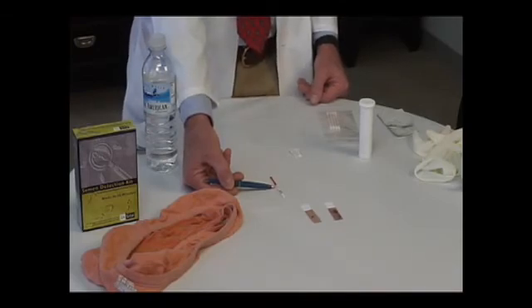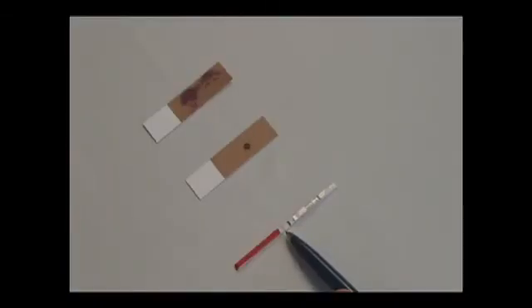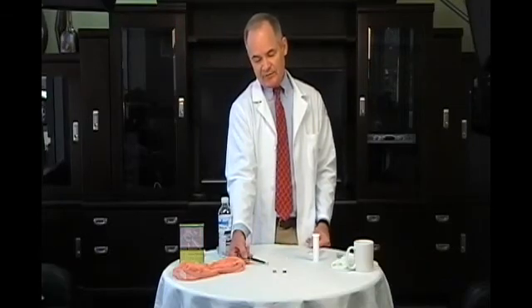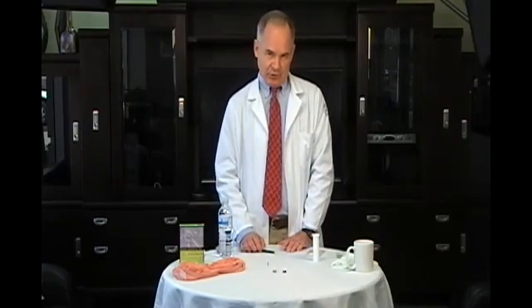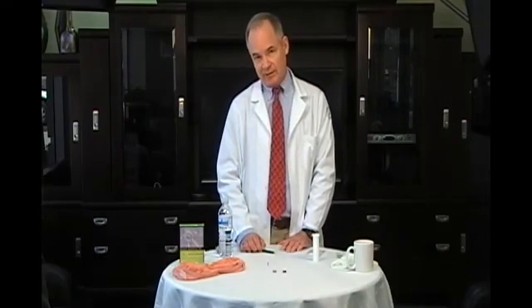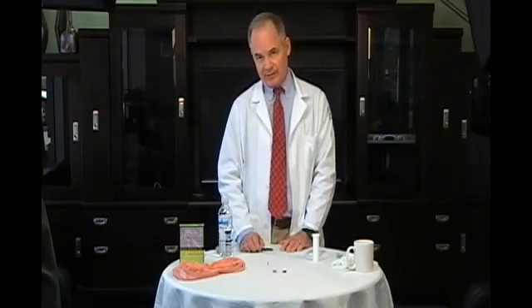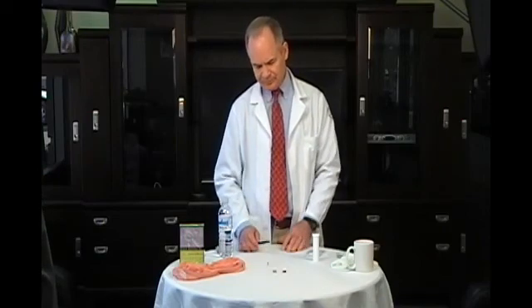The anti-PSA antibody, gold labeled, continues moving up the strip until it reaches the control region, where you have an anti-mouse antibody binding to it, and this also turns red. Now, this control region is calibrated for a PSA concentration of 4 nanograms per mil. At that concentration, the specificity of this test is 100%. In other words, the probability that this is PSA is 100%. So by inference, the probability is 100% that there is semen on the test garment.